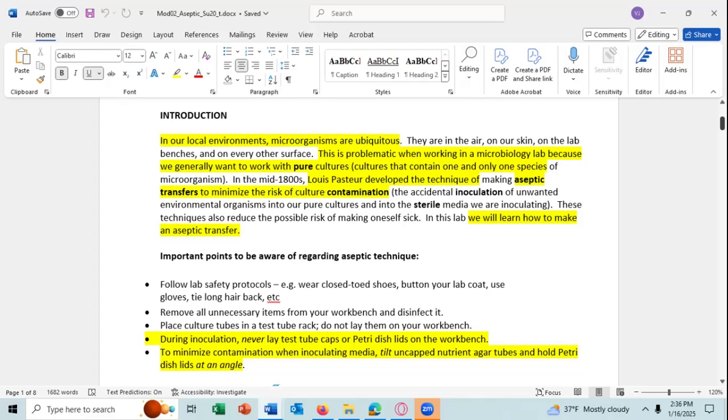His technique was difficult to do, and that is you did it in a liquid culture, and you did it by limiting dilution, and you'd make 10 replicas of each dilution.